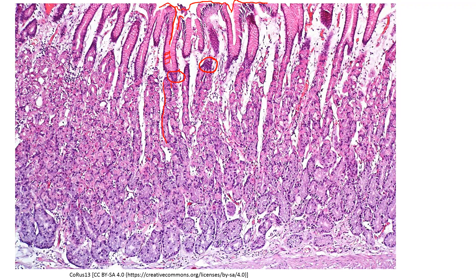Here you can see a gastric gland coming down — keep in mind these are three-dimensional structures, so it may appear to end because we're looking at a two-dimensional section and part of it went away from or toward us. As you move downward from the surface of the mucosa deeper into the lamina propria, the epithelial cells appear to change color: parietal cells higher up are more eosinophilic, so red in color, and then the chief cells lower down are more purple or blue.